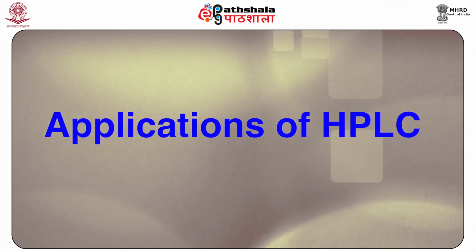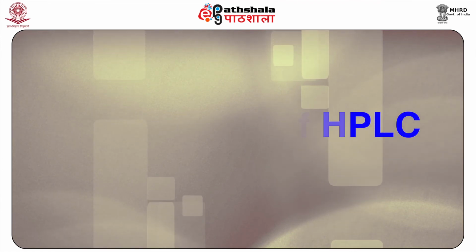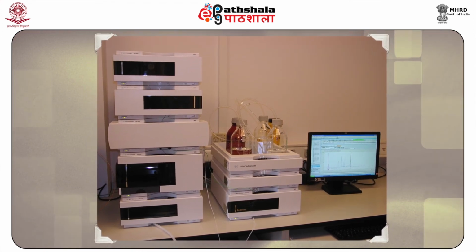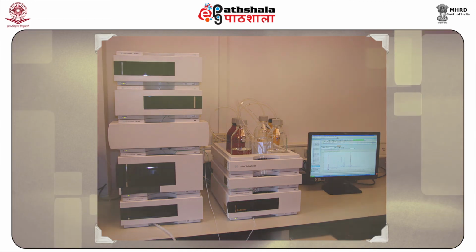These are called ultra HPLC systems. Now, the applications of HPLC. High performance liquid chromatography is an important forensic technique, often used in cases involving drug trafficking. It is used in detecting performance enhancing drugs from urine samples and separating the components of different biological samples.